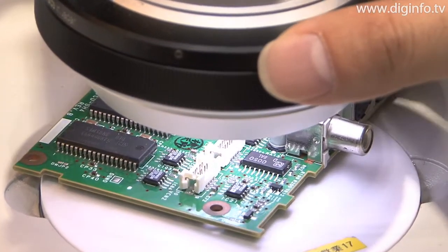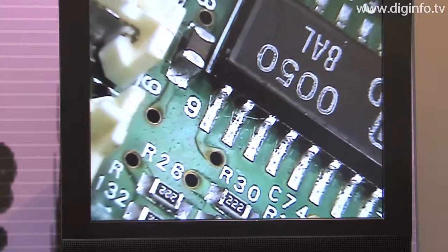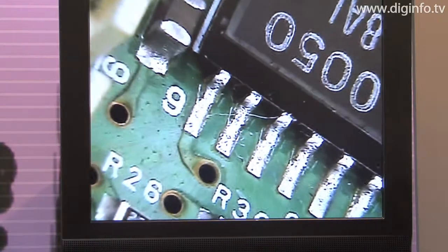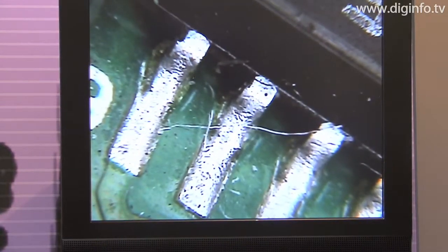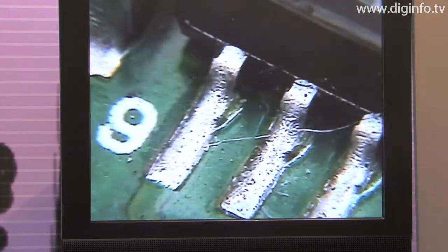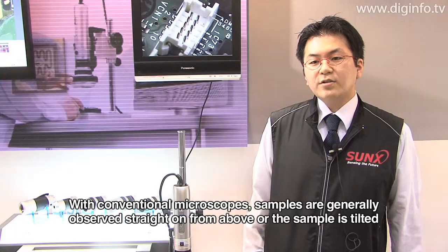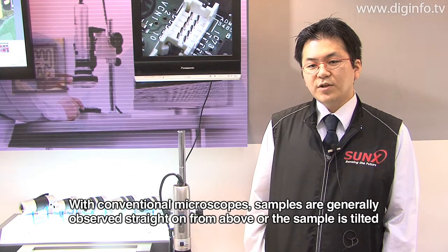The microscope also provides a deep depth of field so that the sample is always in full focus, and as a result, the microscope enables a shared observation environment in which high-resolution detailed inspection images can be observed not only by one person but by many staff members at the same time.